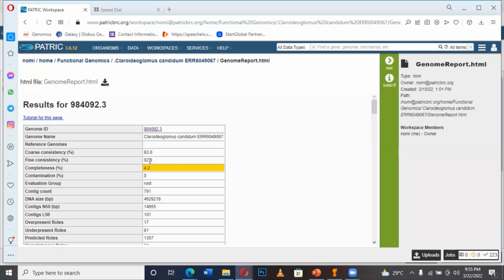So the prediction of those genome features is of high process rates. Meaning that 93 means the prediction was like 93% done, right? The level of the annotation that was gotten was like 93% out of 100. So that is in high condition.